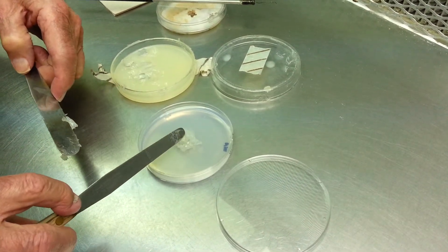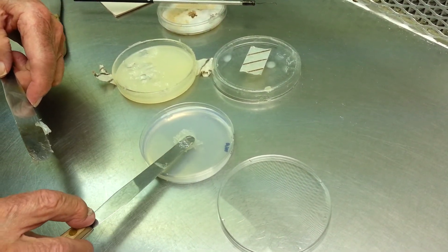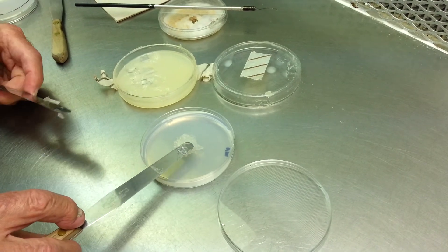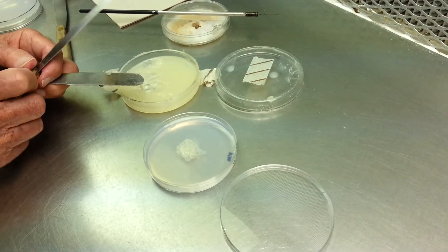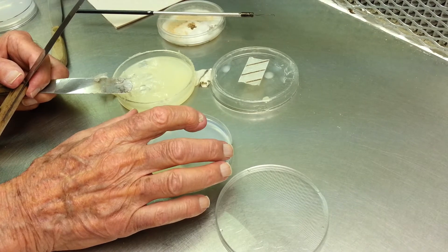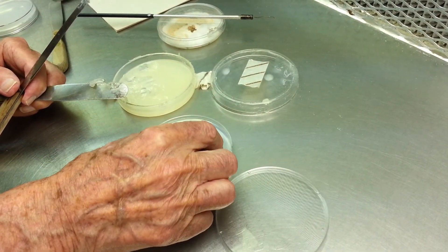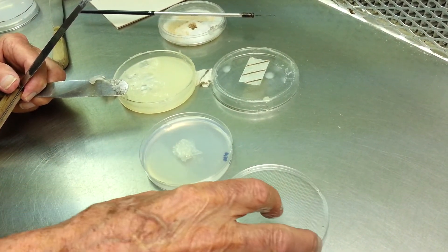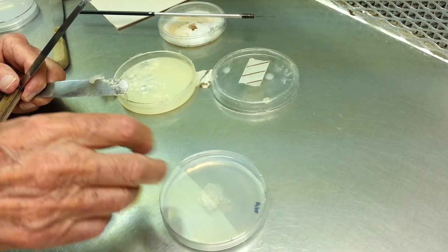And it will grow through the Vaseline? It will go through the Vaseline, and onto the culture. And when it grows out into the culture, we take a piece from the periphery of the culture and transfer it. That's the Vaseline method.